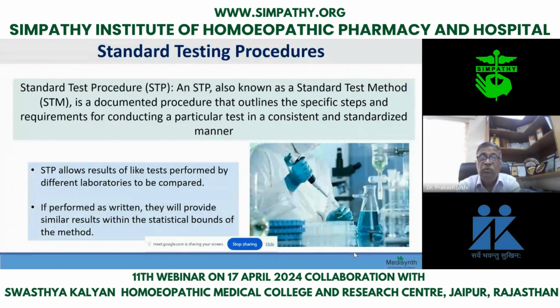In the same way, we have a standard testing procedure. I think we are writing one article soon on STP also. It is a big article. We will be writing it and we will share it with Dr. Khan soon. So how to test? Why do we have a standard testing procedure? The purpose is that whosoever works, whosoever tests, will follow the same thing. It is not like when in a house you make vegetable, for example beans, you ask 3 ladies to cut the beans, the size of the beans will be different.